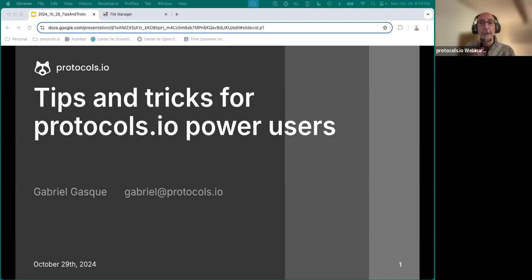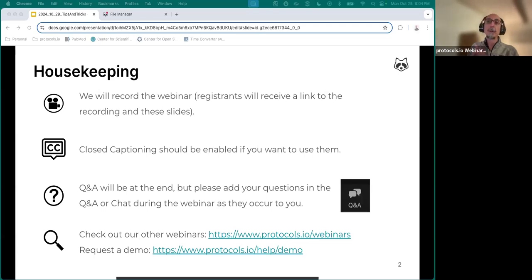This is an advanced webinar that assumes that the attendees are already familiar with the platform and know the basics. So I will not be covering the basics, but if you would like to get some basic training, you can visit the URLs at the bottom of this slide.